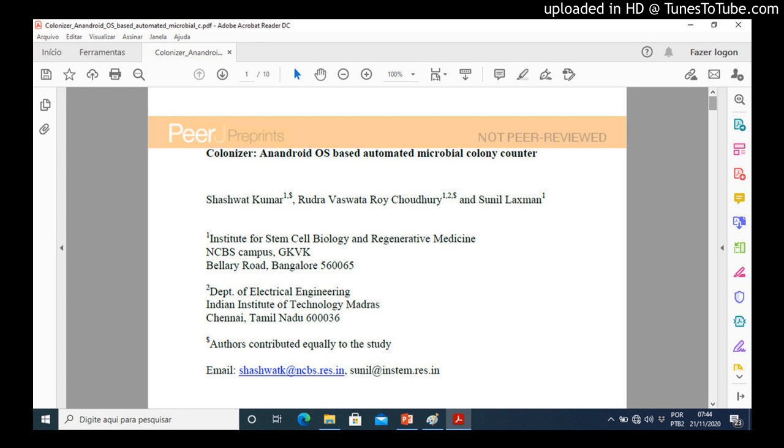Materials and methods. Strains and growth conditions. S. cerevisiae colony growth: yeast colonies grown on yeast extract peptone dextrose (YPD) agar in standard 9 cm petri dishes and grown at 30 degrees Celsius were used to collect sample images. A single batch of yeast colonies of varying densities between 550 and 650 were grown on 4 agar plates.